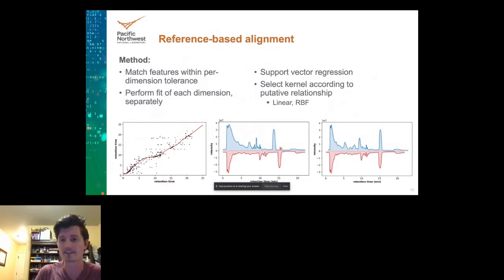What's shown here is a purposefully difficult problem where we had a degrading LC column. We didn't know it at the time, so this ended up being a cool test bed to test the limits of our approach. We had the putative pairs in drift and m/z, and then plotted retention times with a pretty wide window, and then fit a radial basis function support vector regression, so basically a nonlinear robust outliers regression to the data. And then we can apply this transform to take what looked like, before, the total ion chromatogram. We have these major peaks here that are misaligned, and then after, they come right on top of each other.